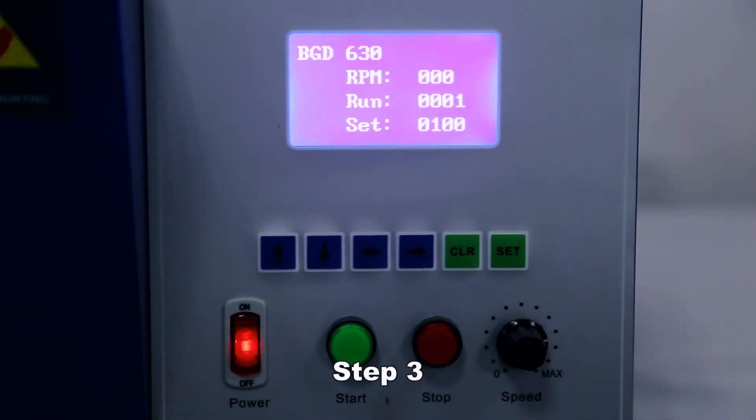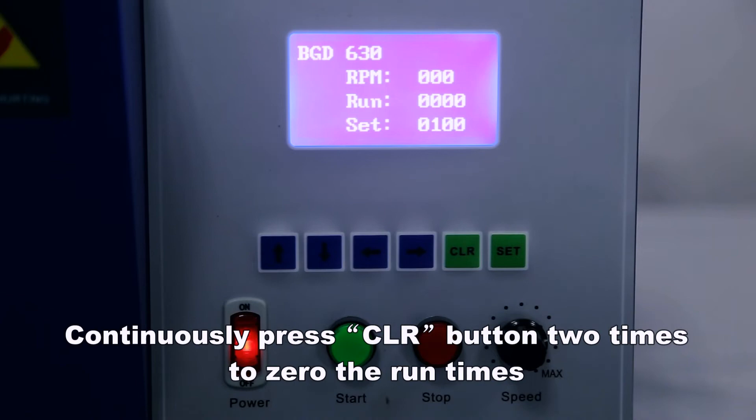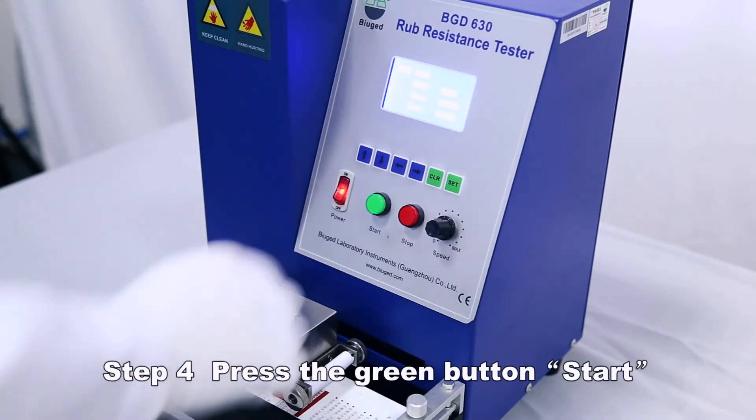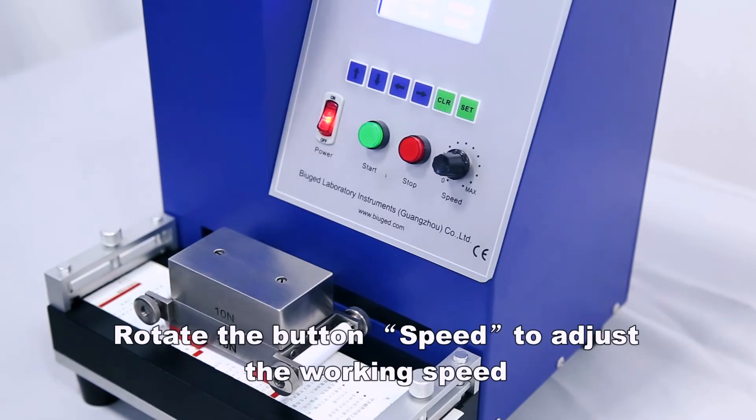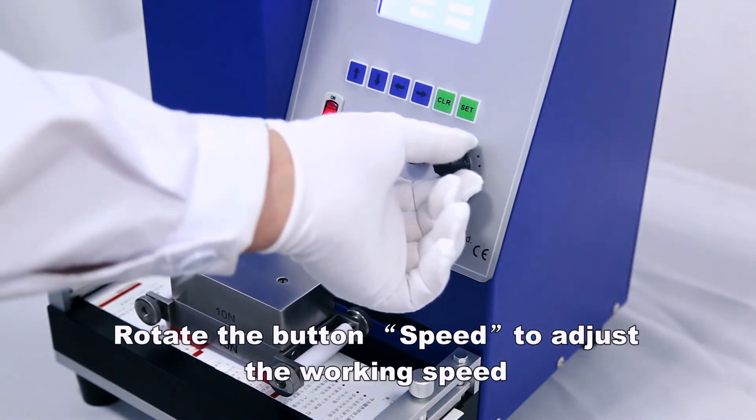Continuously press CLR button two times to zero the run times. Press the green button START and rotate the button speed to adjust the working speed.